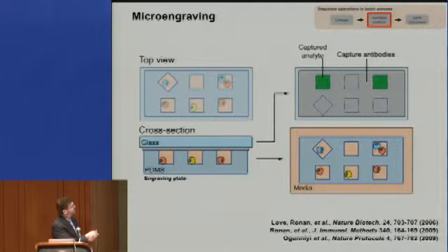What we can do is temporarily close a glass plate with that coating against the array so that each cell now sits in its individual reactor of about 100 picoliters. If we allow this to evolve in time, the cells will secrete material into that solution and will be captured onto that other surface. And so after a short period of time, we can separate the two plates.